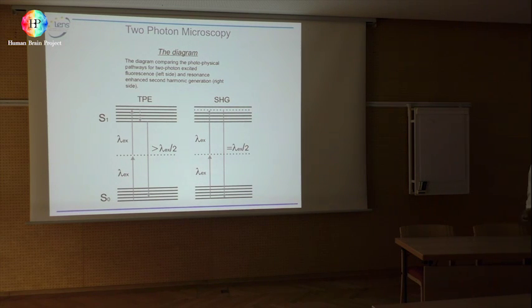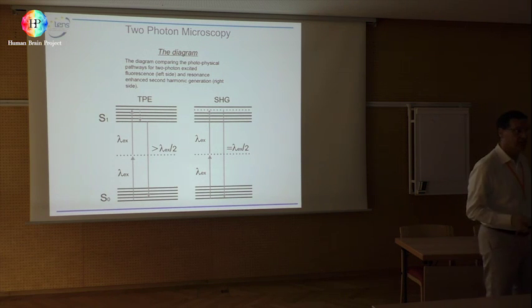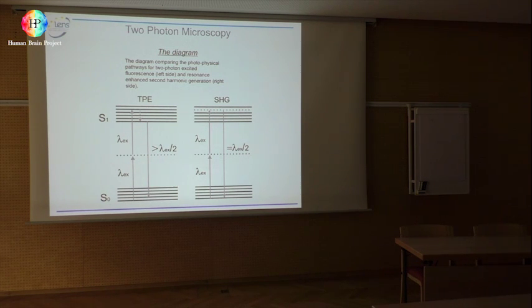But you can have another effect, which is typical in nonlinear optics, in nonlinear crystals. It's the doubling of the frequency by a factor 2. In other words, some parts of the tissue, like collagen, for example, multiply the frequency by 2. So 2 photons are exactly converted, through a virtual state, into a photon which has exactly double the frequency. So this is a coherent process, because the phase of this photon is completely locked to the phases of those photons. You keep the phase. The memory of this photon is exactly related to the memory of those photons.